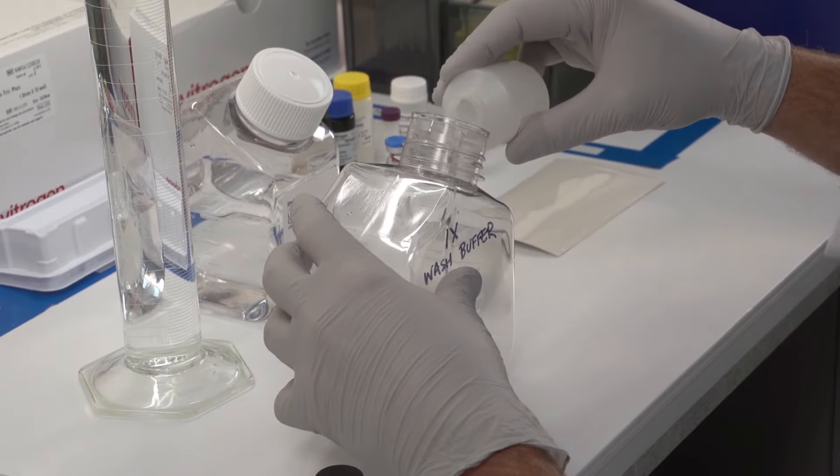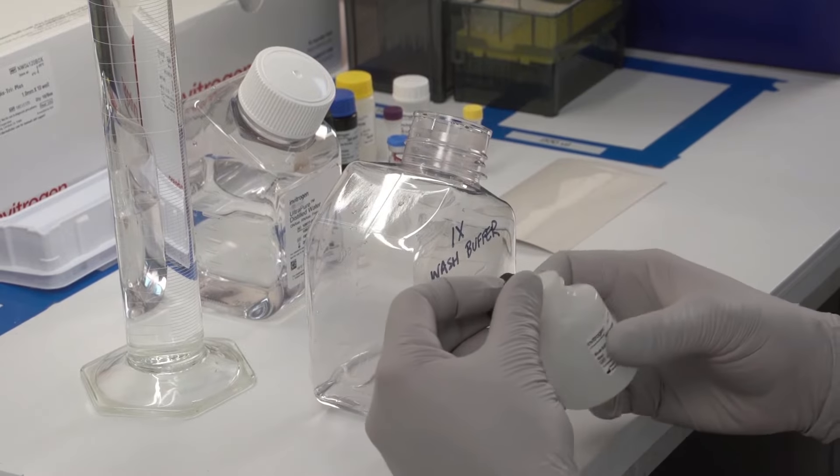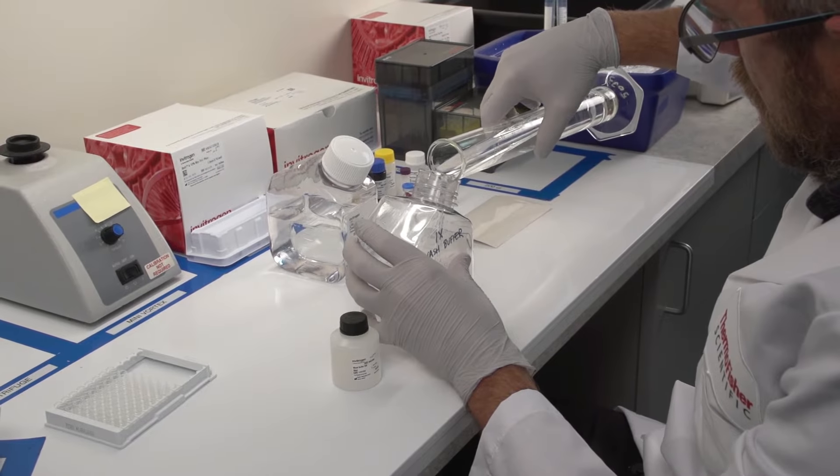To prepare wash buffer, let the wash buffer concentrate reach room temperature and mix to dissolve any precipitated salts. Dilute the concentrate in deionized water as instructed in the protocol.